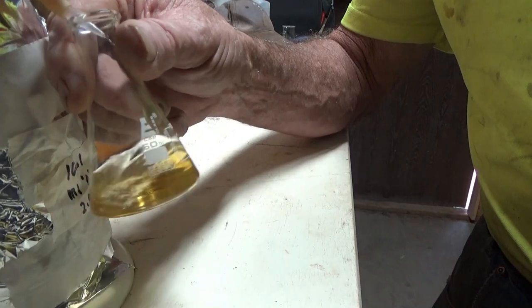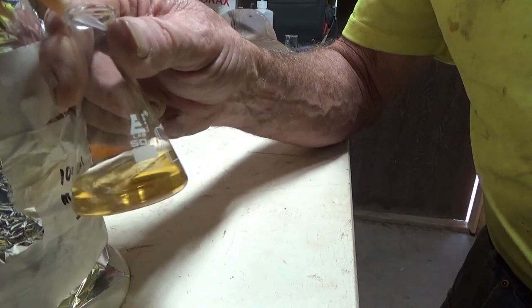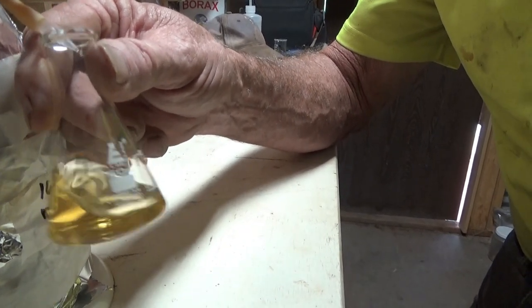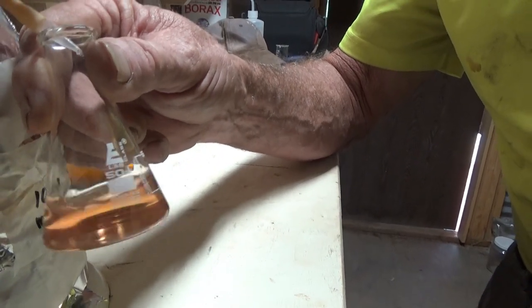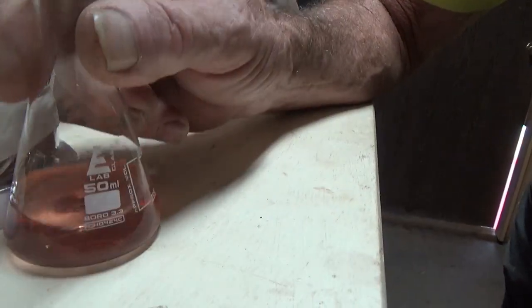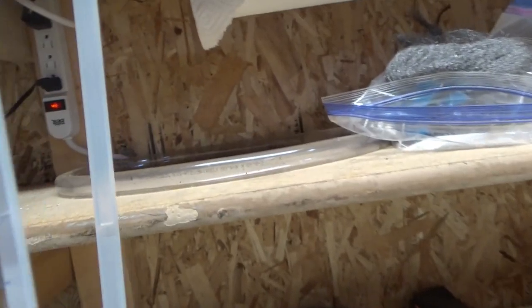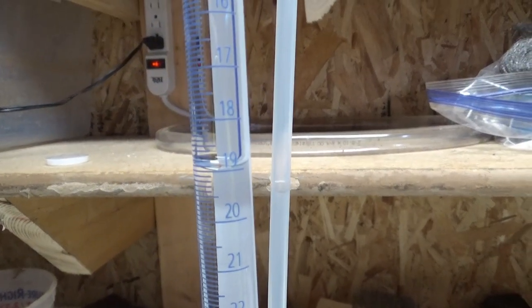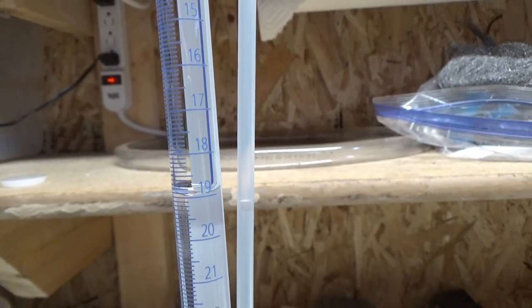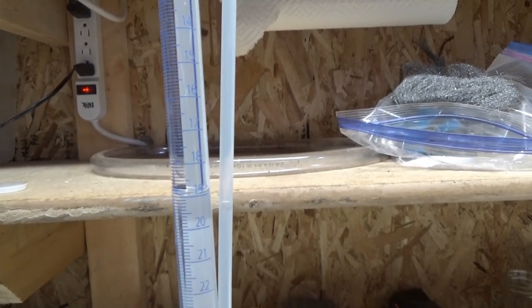Now, since I've got a pretty good idea where this is going to wind up, by the way, we made brand new solution just to make sure there were no errors, although I was confident there weren't any. The solution can be used for leaching, so it's not like anything's going to be wasted. In theory. Bingo. It turned. Okay. So that's at 19 mils, which according to the instructions should be 9.5%. Clearly not the case.